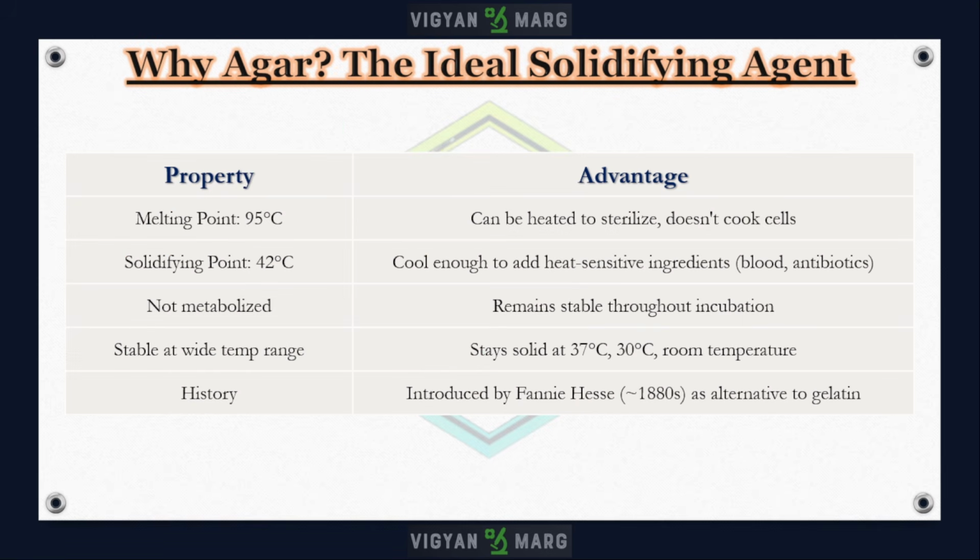And we move on to the next. Why is agar almost universally used as the solidifying agent in microbiology? This is the first question that will come to our mind. So we will look at the properties of agar one by one.